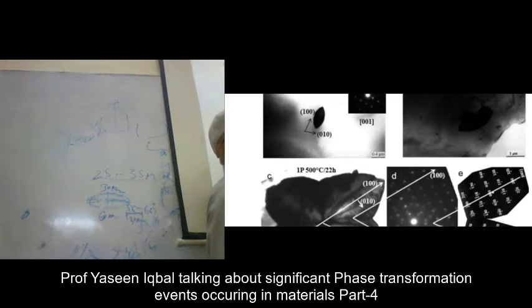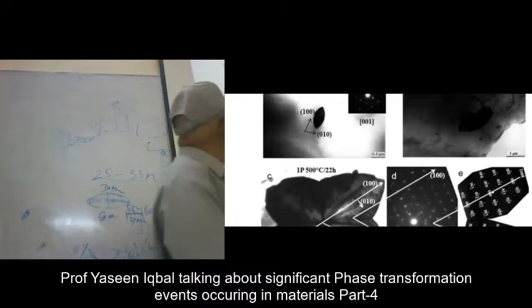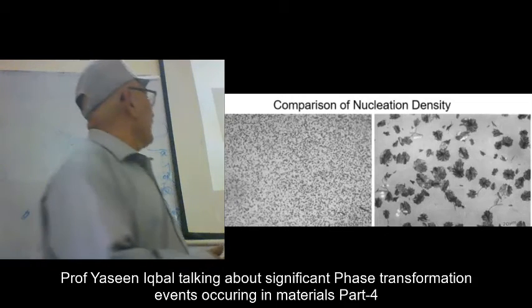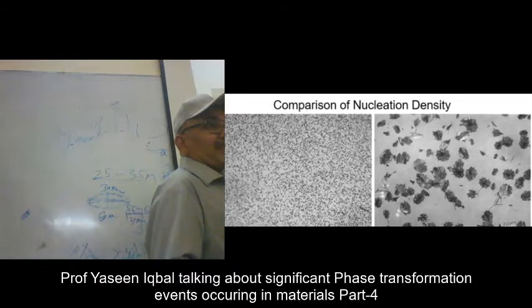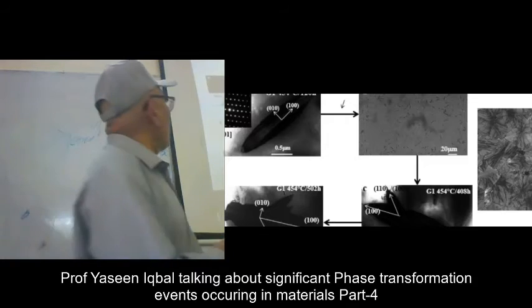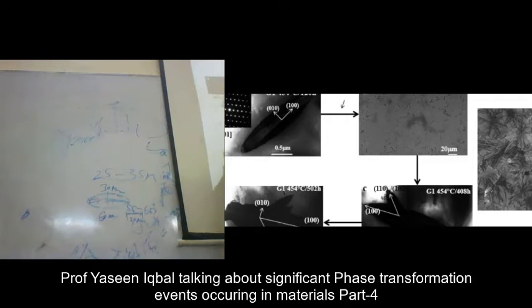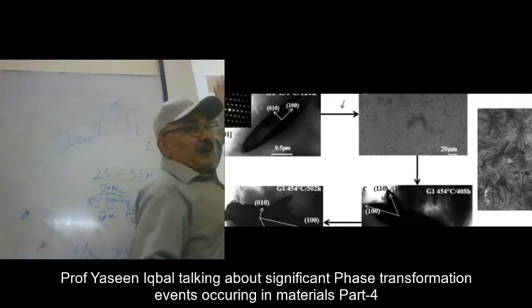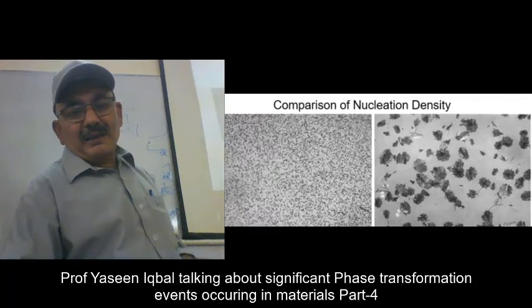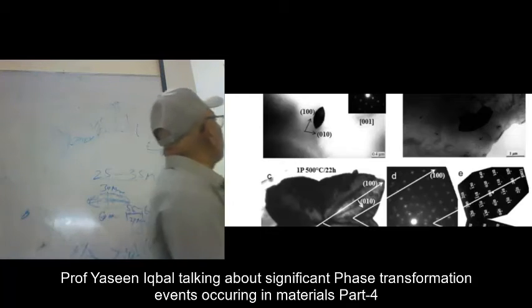this was the outcome of the phosphorus pentoxide. If you remember, it is this crystal, the phosphorus pentoxide one, and by 1 mole phosphorus pentoxide, I changed the morphology of this crystal from this to this.